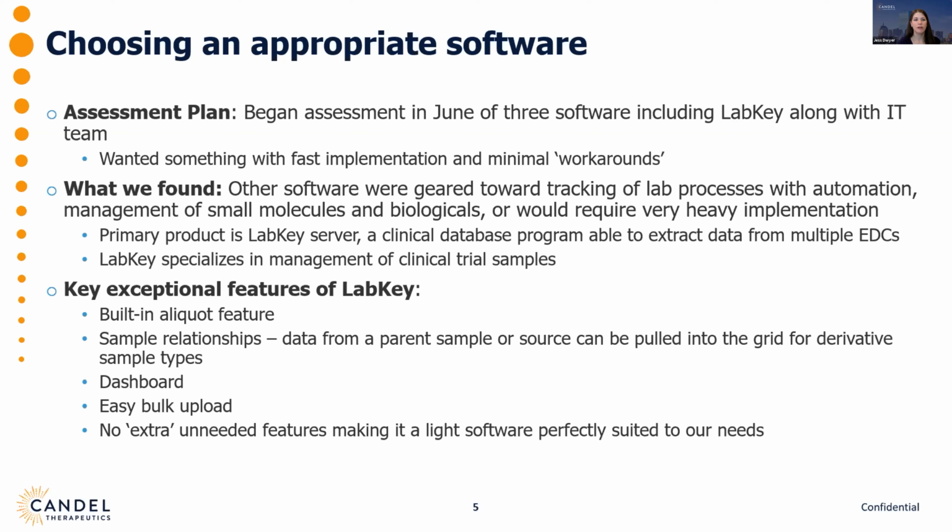I think being able to capture that information from a source or a parent and bring that data into the grid of a derivative sample type really stood out to me. And when I asked about that same feature from other companies, it sometimes sounded like more of a hassle, but with LabKey, there was a clear path to how we could get it done, which was really reassuring.